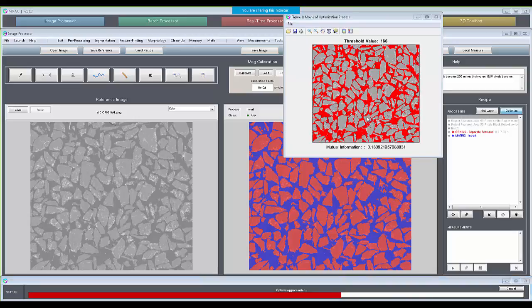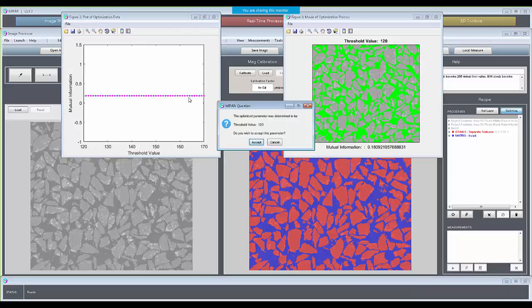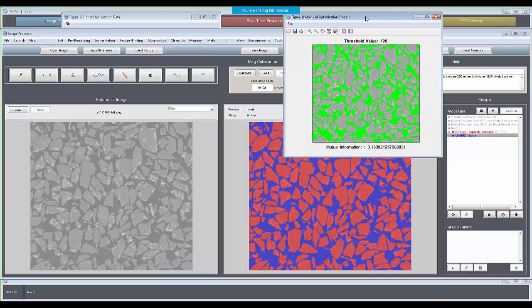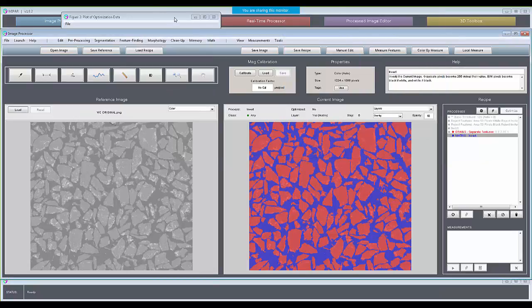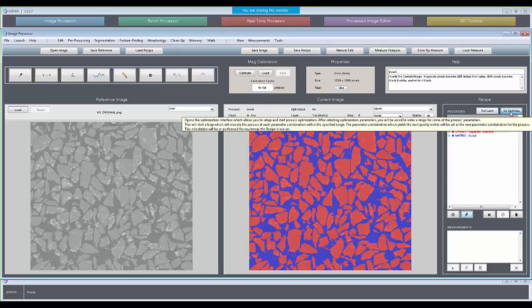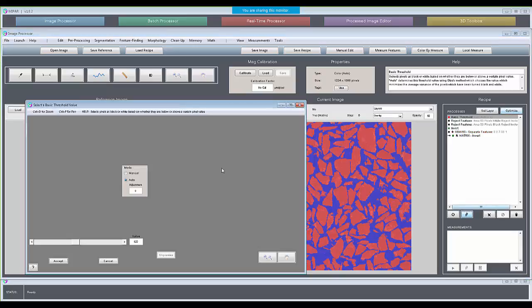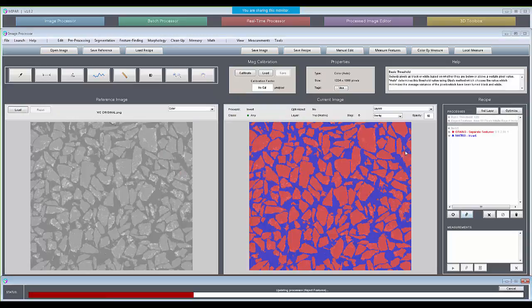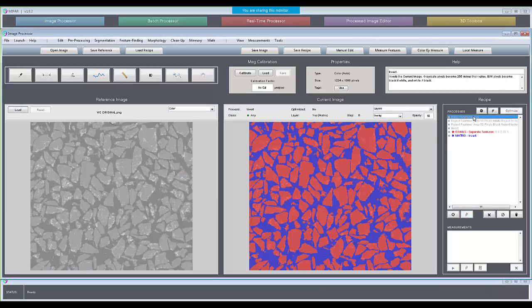That's interesting there. Why is that not changing? Oh, okay. It's because we have auto set. So, my mistake. With auto set, that is actually forcing it to do the auto calculation at every step. So it's coming up with 120 each time. That needs to be made a lot clearer. Apologies for that. Well, let me turn off the auto and make sure.